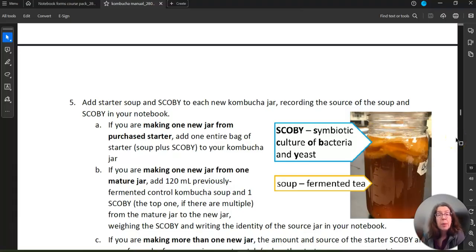put on a new paper towel with no holes, use the jar ring lid to screw on to hold the paper towel. You're then going to put a masking tape saying your group number and what you've put in the jar. You can also write your group number on the top of the paper towel. Don't put a masking tape. It'll mess up the breathability of the paper towel. You can just write right on the paper towel with Sharpie.